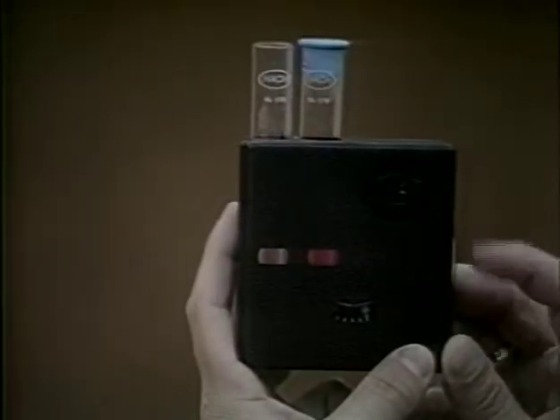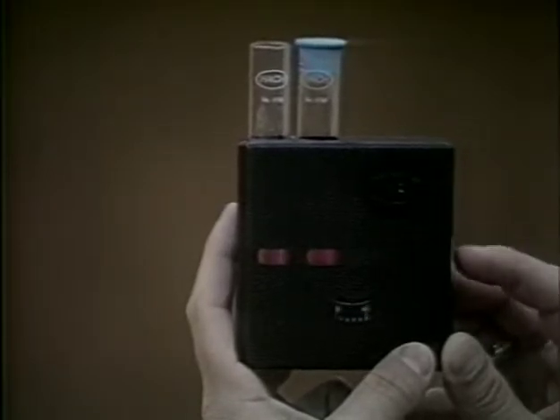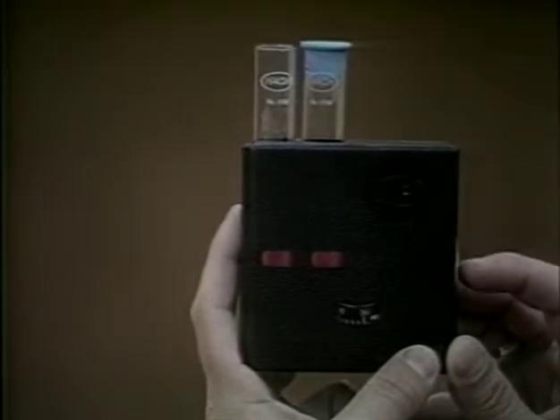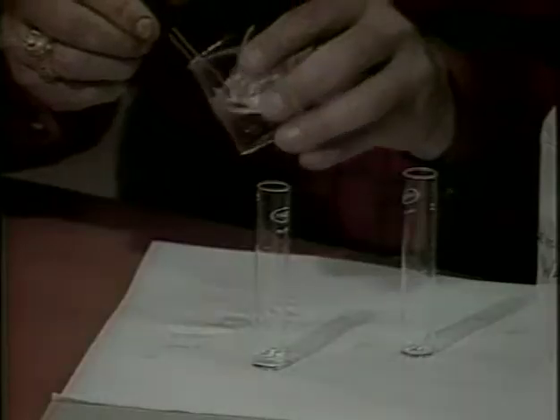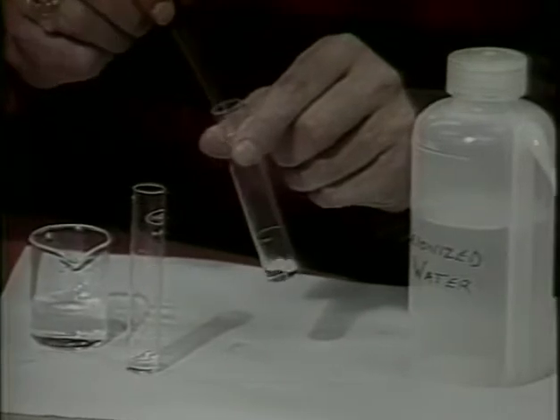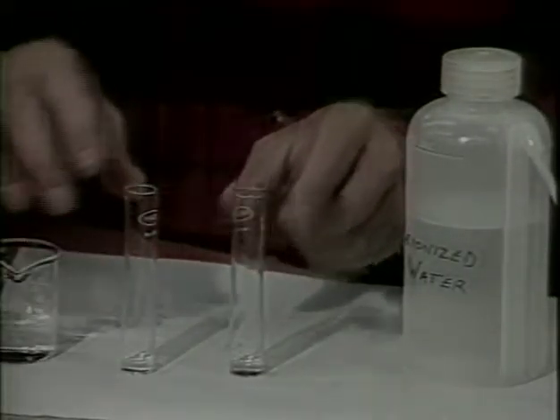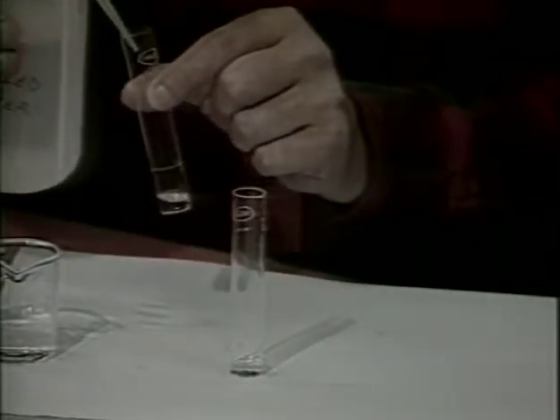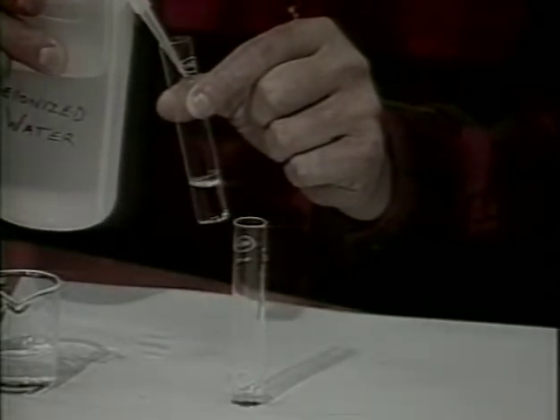If the reading on the wheel is greater than 0.45 or 90% of the maximum, a dilution of the sample is necessary so that the reading is within the color range which is detected by the color comparator. The same procedure which was used to dilute the sample when testing for ammonia is carried out so that the sample is diluted 5-fold. After the dilution is performed, test for nitrite as described above. Make sure to dilute before you add the nitrite powder pillow.